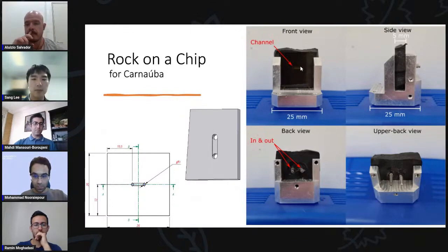It's a tape that is transparent to X-ray and is extensively used in experiments here at the synchrotron beamline, because X-rays do not see it. Otherwise it would interfere with our experiment, and it's just glued here, inside the channel. Thank you.